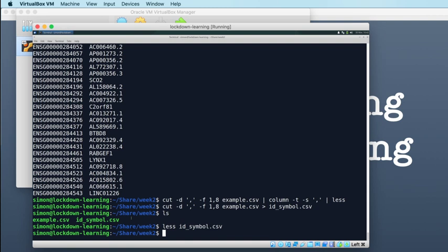I do appreciate that a lot of you may have gone from not having used the command line at all a week ago to me writing commands with lots of pipes in, which look very, very confusing if you've never seen anything like it before, in just a week. And so that difficulty does tend to ramp up quite quickly when we get to this stage.